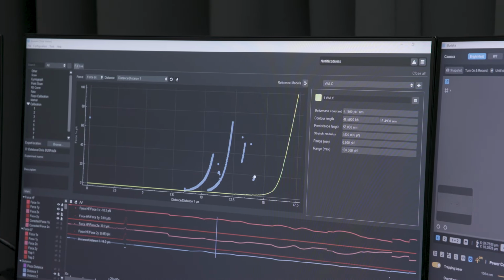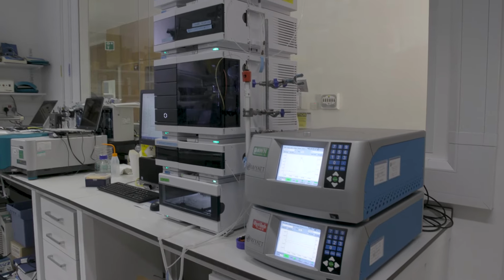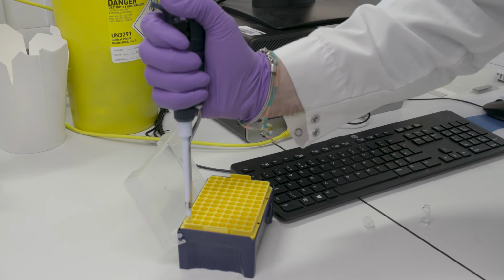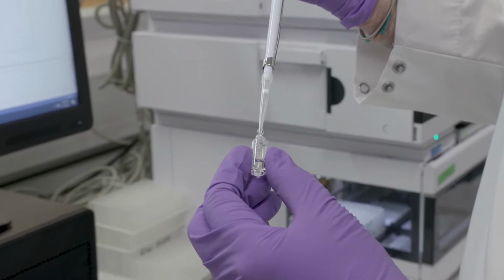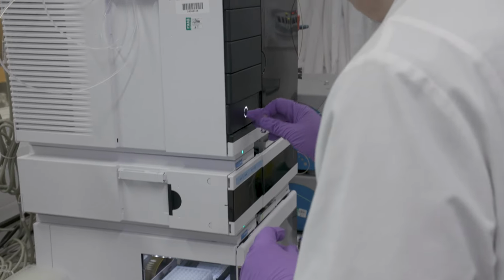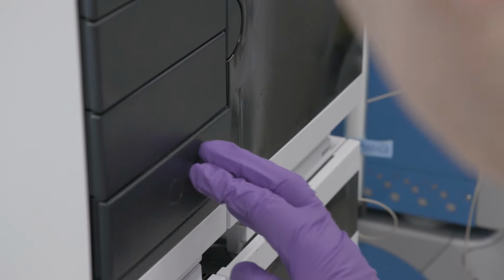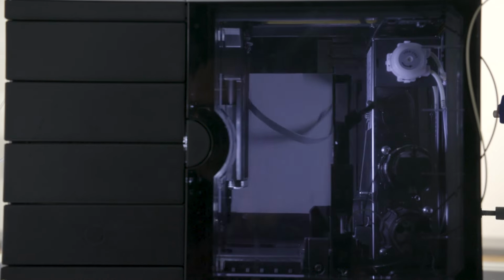Then we have other pieces of equipment, such as size exclusion chromatography with multi-angle light scattering. And that's the technique that allows us to measure precisely the molecular weight of a protein or complex that we have. It also lets us look at whether it has post-translational modifications.